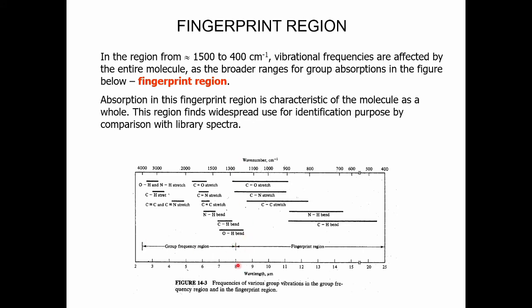So when you analyze an infrared spectrum, it might be difficult to look at anything in the fingerprint region because there are so many signals. There's lots of signals that show up here, and they all kind of overlap each other, so it's really difficult to get a very concise measurement. So for now, when you analyze an infrared spectrum, focus on the group frequency regions.